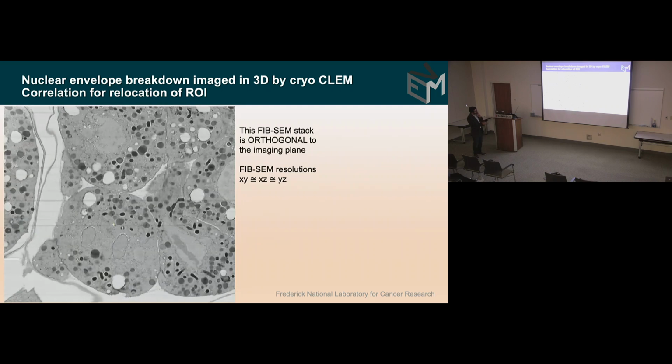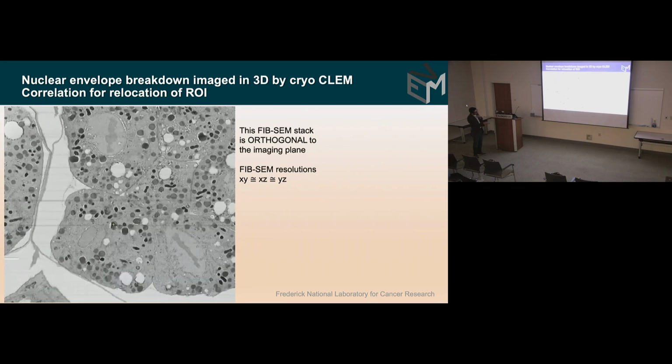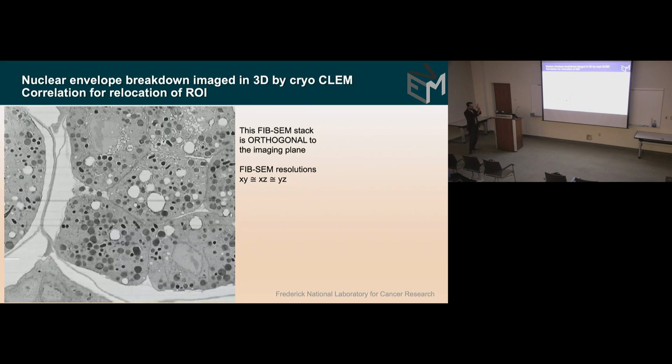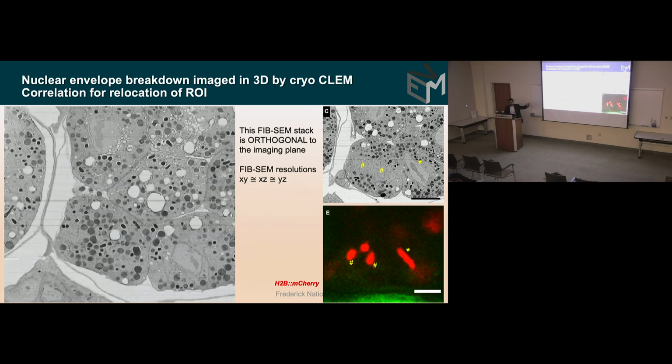There it is. Right there, you can see everything looks like just a single line because you've caught it just at the right time where the maternal and paternal DNA have mixed and they've lined up at the equatorial plane. Right? So this is the only way to do it, and we captured it, and this process is done on the order of seconds. So we had to be exactly right.